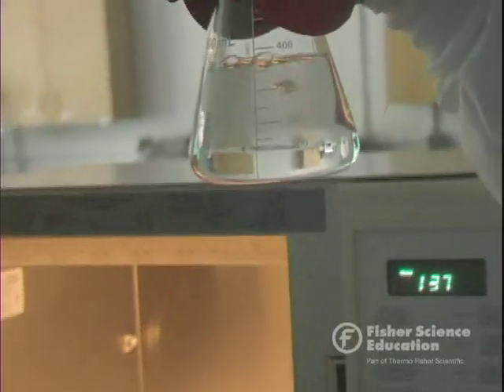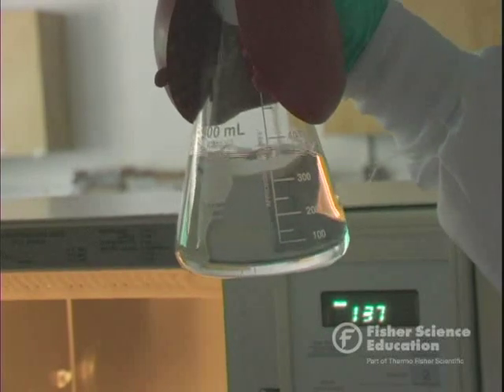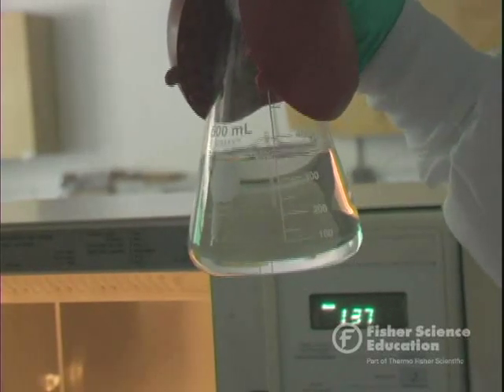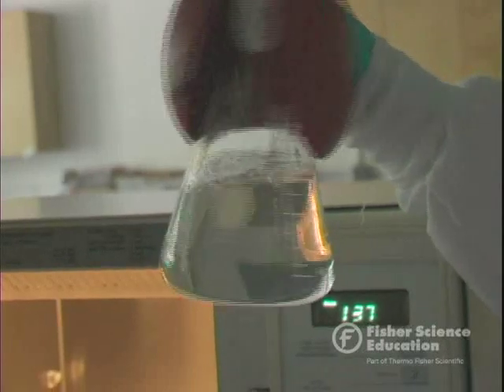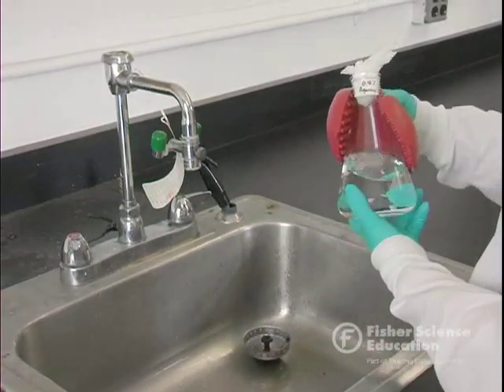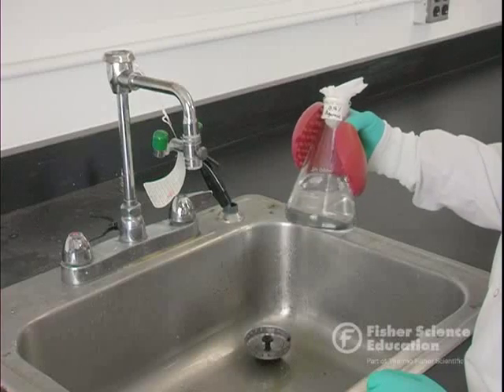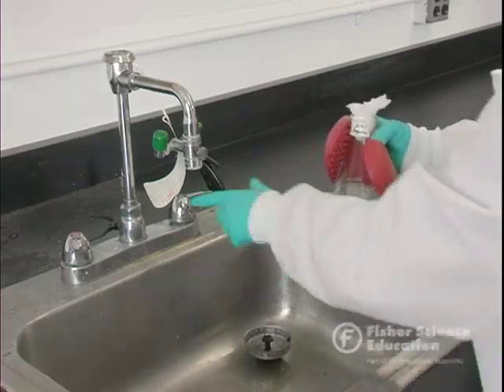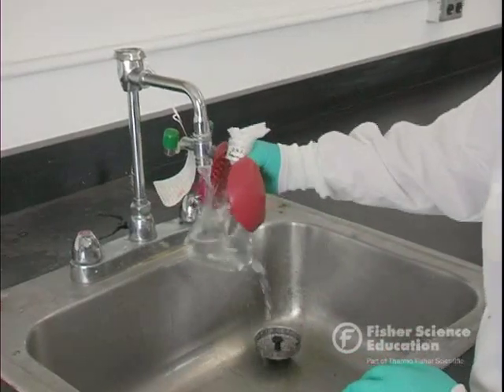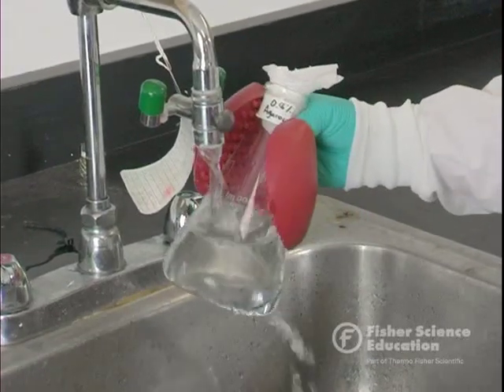Now we can't pour it when it's this hot. You either need to let it cool while swirling it occasionally, or you can put it in the sink — sturdy flasks will take the temperature change without breaking. You want to cool it to about 55 degrees, which means it should still be hot but not so hot that you can't hold it in your hand. To use the quick cooling method, turn on the water and hold the flask into the stream, gently swirling to cool the surface and turn the liquid inside.